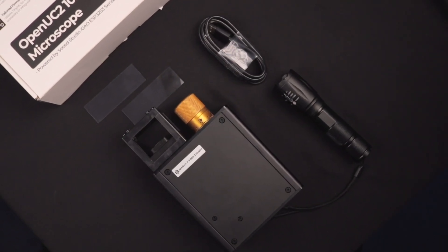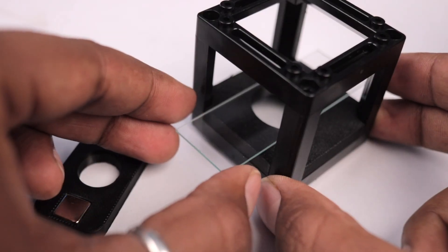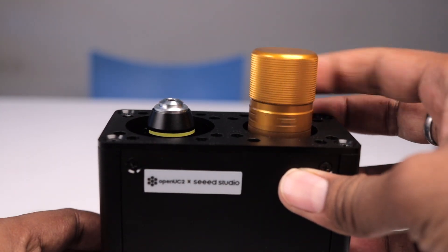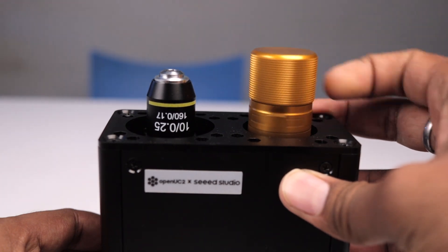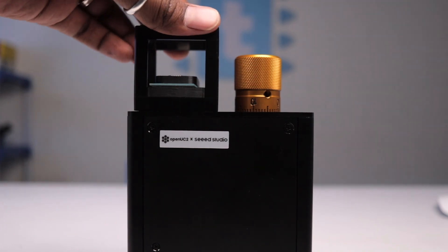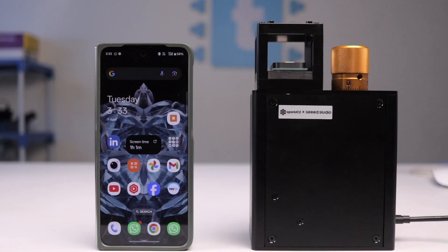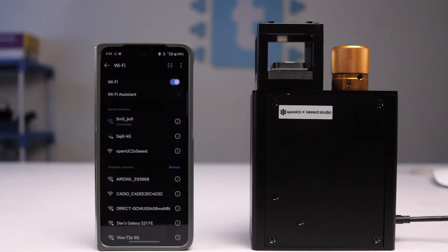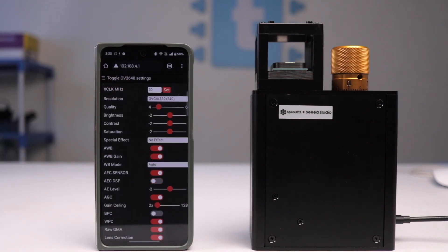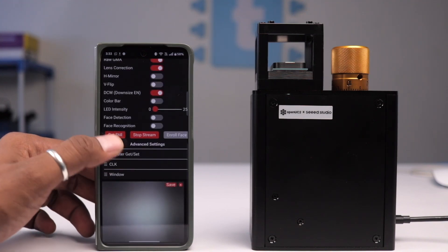Now let's see how to use the microscope. First, remove the plastic housing — you'll find a magnetic holder where you can add the glass slide and place it over the sample to hold it in position. Below the case there's a lens which can move up and down via the micrometer screw to adjust focus, and this lens is interchangeable so you can swap it for a new one depending on your application. Add the plastic gauge above the lens, insert the sample above it, power it up via the Type-C cable, connect your phone to the access point created by the microscope, and open IP address 192.168.4.1 in your web browser to get the camera web server interface.